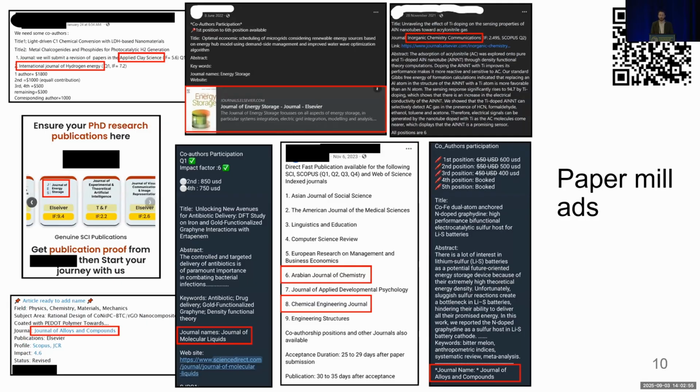So in short, we built a semi-automated pipeline to find this signature. It can be applied on an artisanal article by article basis, or you might be able to use some of the data that we've extracted to build a training set for a much better tool, with a much higher sensitivity to this sort of thing. And I'd also like to emphasize that images are data, and metadata is a crucial part of images. We were talking about image provenance analysis earlier. They should be included, particularly where they form a crucial basis for actually reproducing the results shown in the image itself. Thank you for listening.